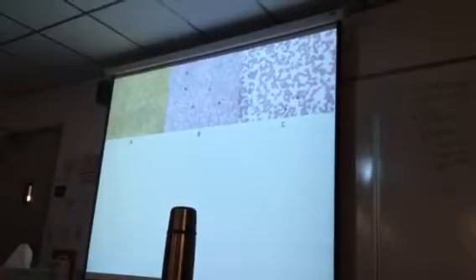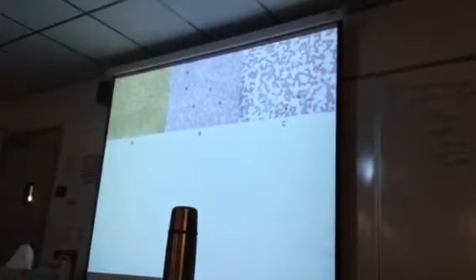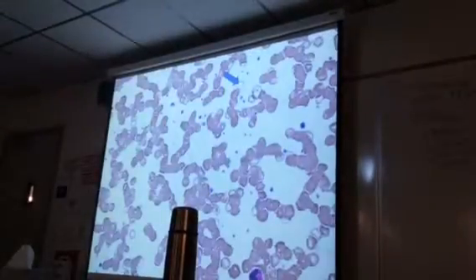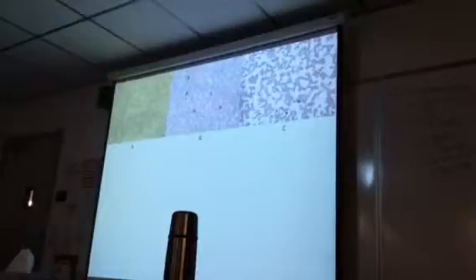Once again, sickle cell anemia. If you look closely, look for some of the cells to be puckered or sickled. I may even have you identify a sickled cell. Whereas in C, what we saw was the microcytes. That's what I look for when I distinguish the anemias. And for the eosinophilia, I look for a lot of eosinophils. You usually don't see more than one in the same view.